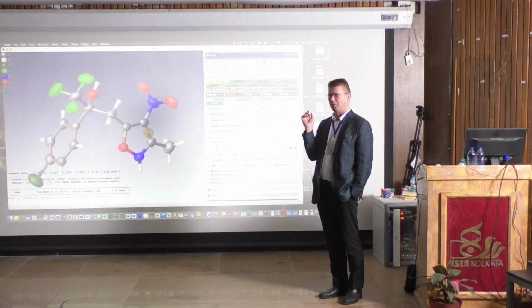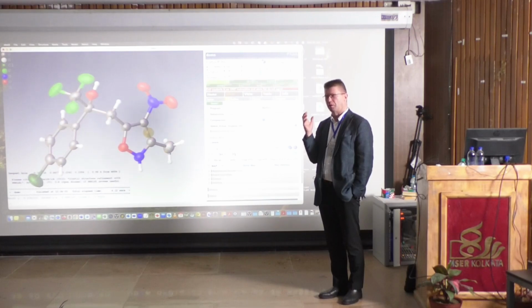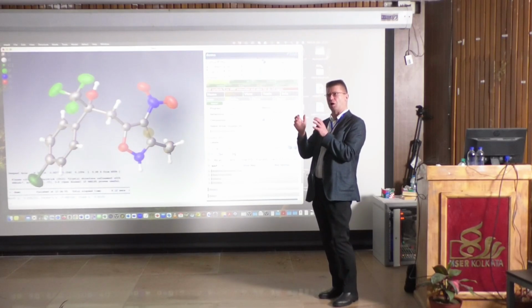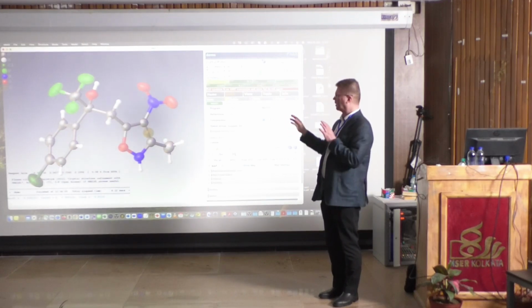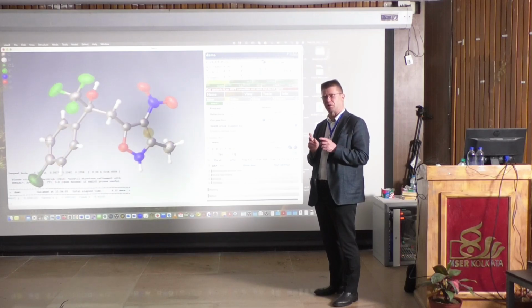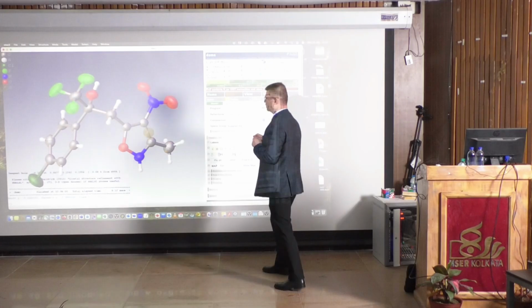I'm not sure if even your boss realized this, that the computer program made a mistake. This comes from the fact that the computer program doesn't know the atoms. The X-rays don't know the atoms, and they don't know how they are connected. So it's our business to see. If you remember the 5-membered ring, in the 5-membered ring there is an sp2 carbon, which means that there's a double bond in there.